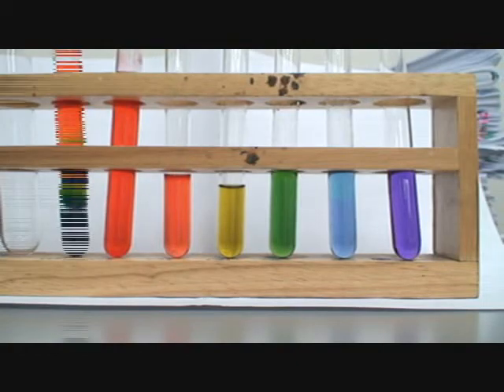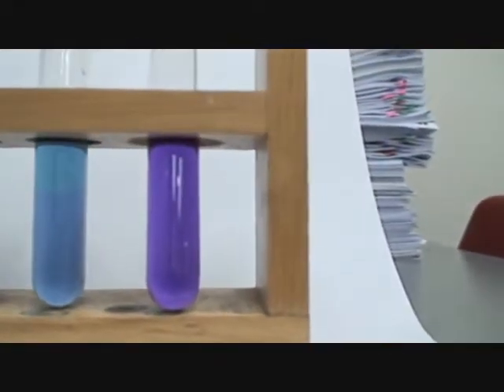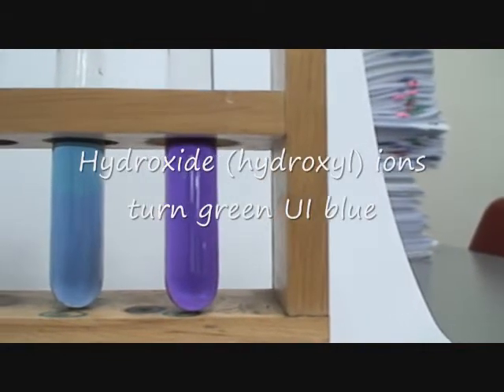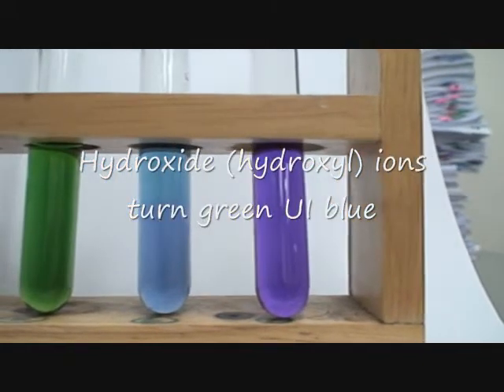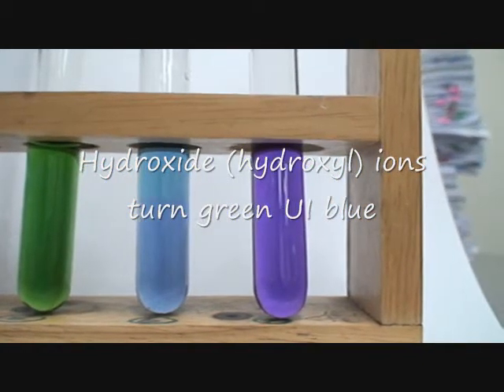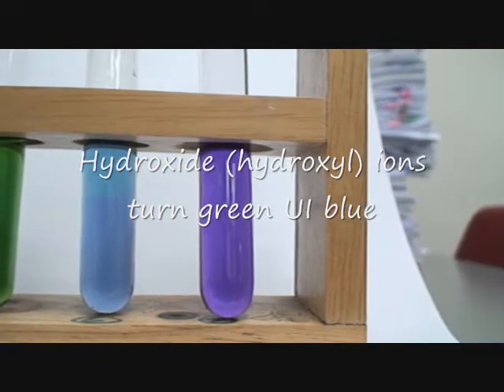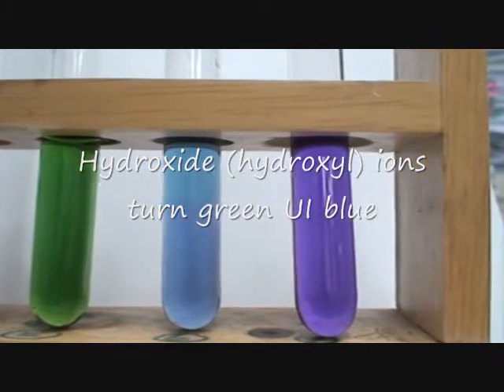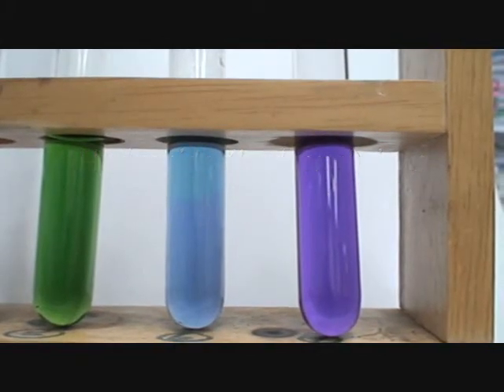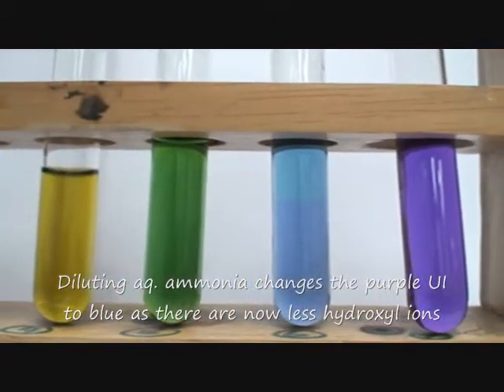The reason why universal indicator is purple is because it has lots of hydroxide ions, and when you have fewer hydroxide ions you get blue. So what I did was I took aqueous ammonia and diluted it to get blue, and if I further dilute it to a very great extent then there are no more hydroxide ions.